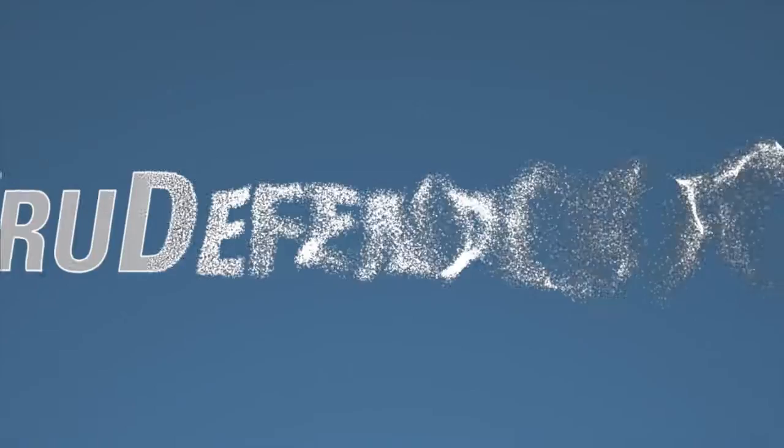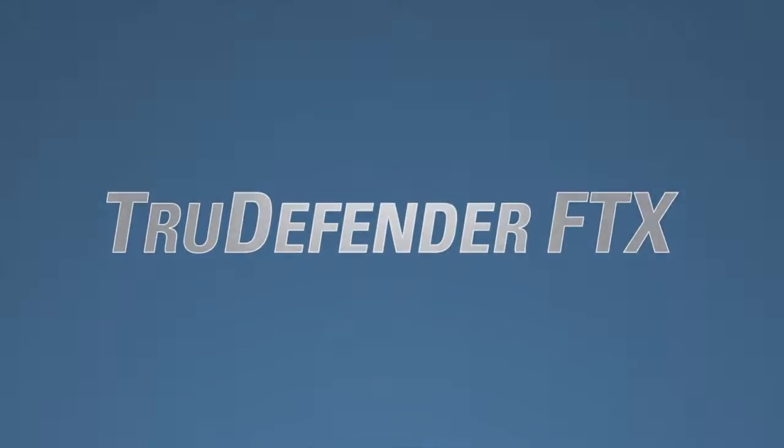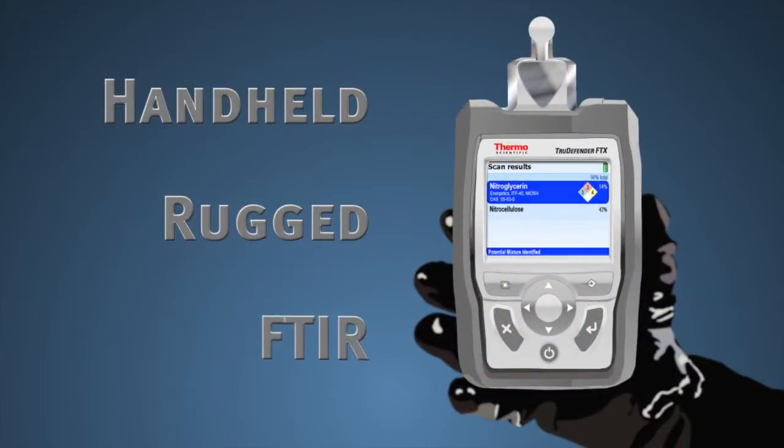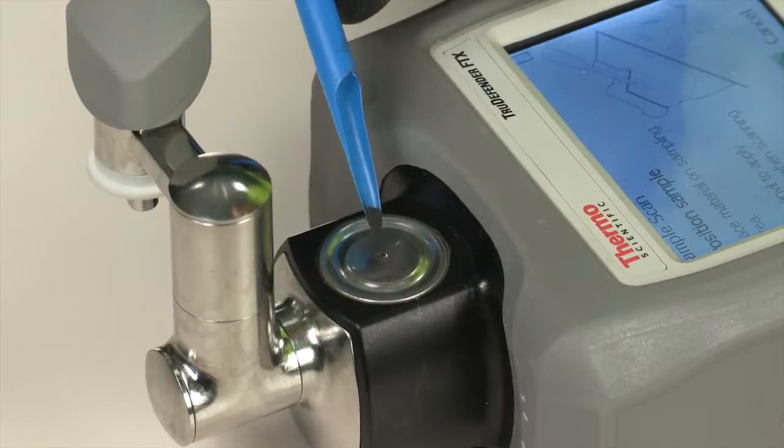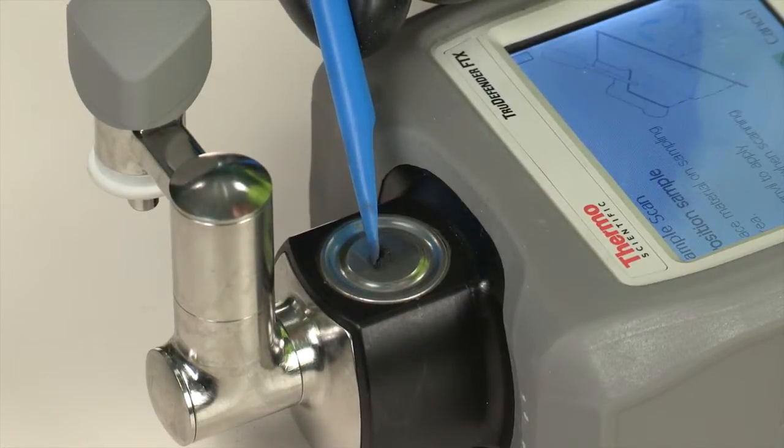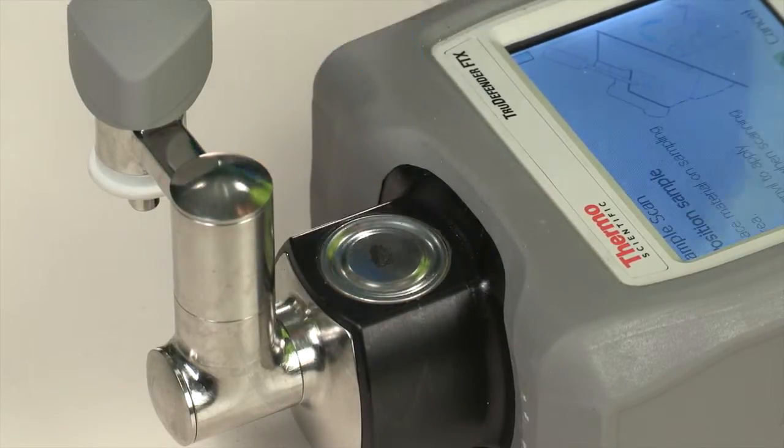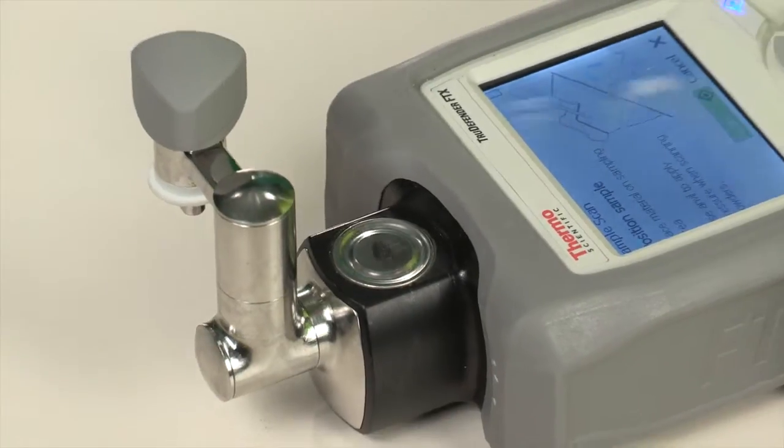the TrueDefender FTX analyzer is the latest in our family of handheld, rugged FTIR tools for chemical ID. The TrueDefender FTX includes a new anvil sampling head engineered from the ground up for better sample control and easier decontamination.